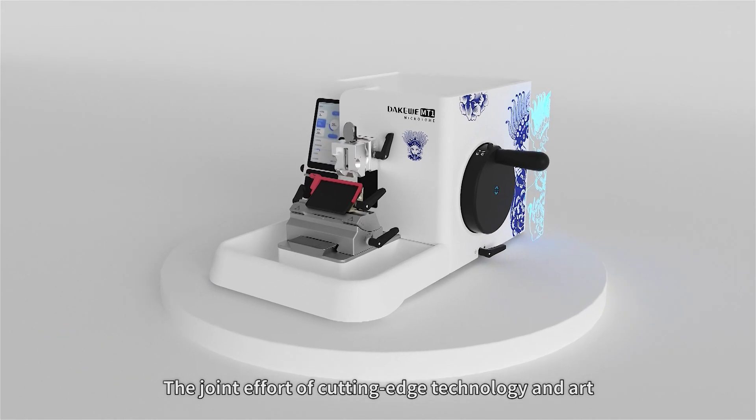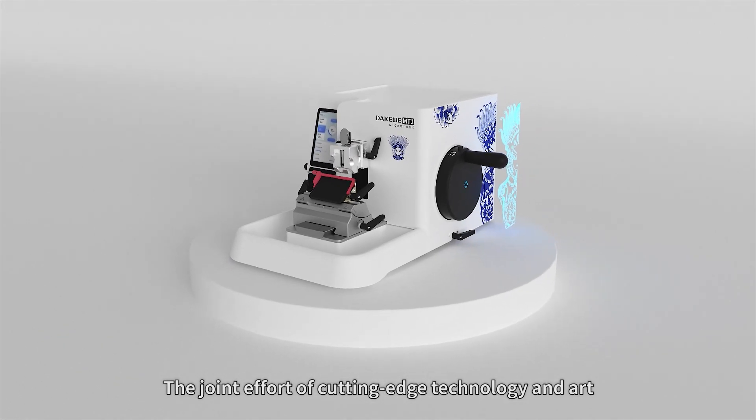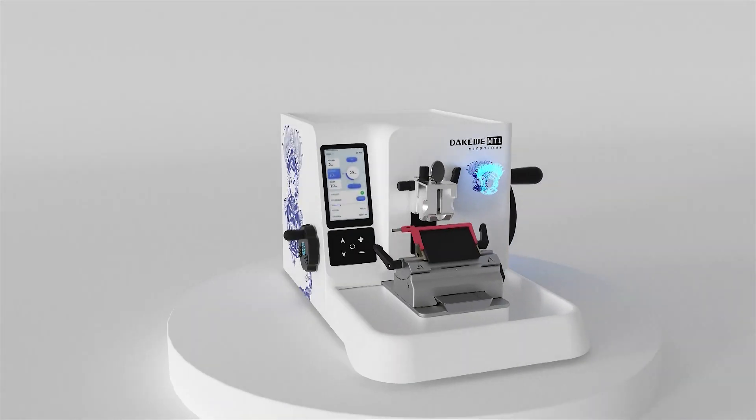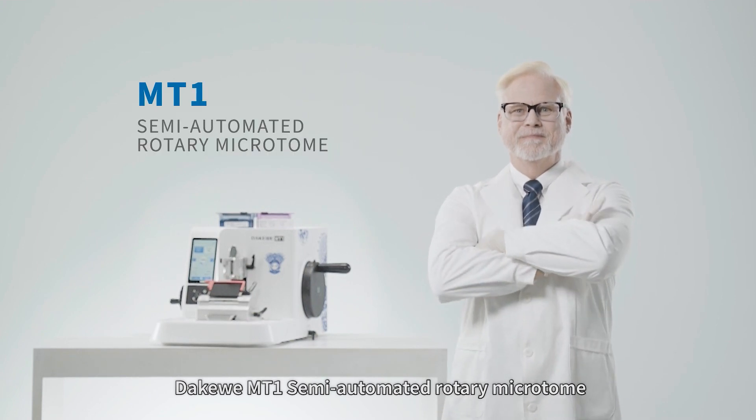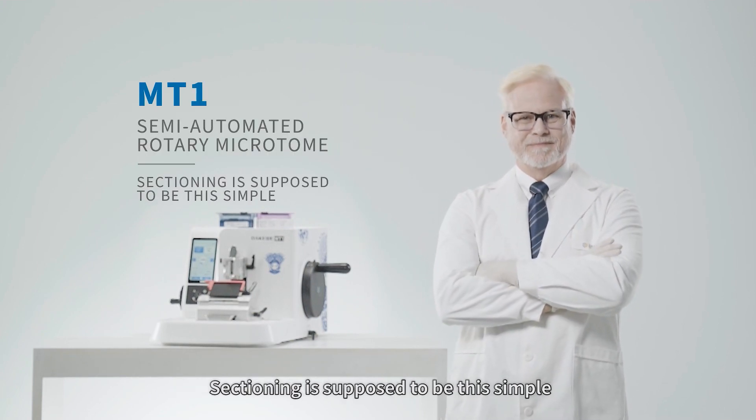The joint effort of cutting-edge technology and art — Dakewe MT1 Semi-Automated Rotary Microtome. Sectioning is supposed to be this simple. Dakewe: bettering human health.